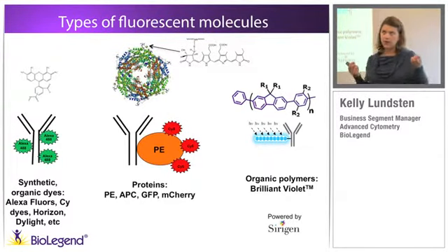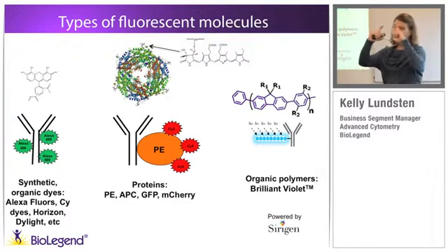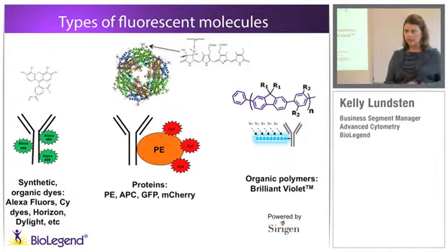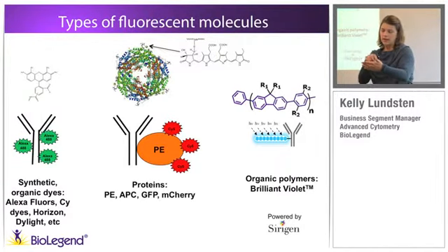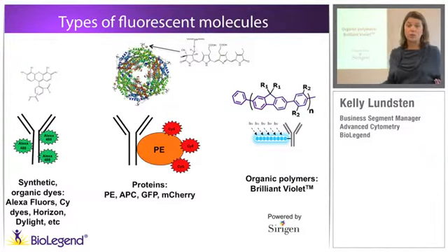And if you think about the structure of what an organic fluor looks like, you have something like a pyrene or any sort of cyclical hydrocarbon. It's a rigid structure, and the element of conductance of this molecule are going to be the shared electron pairs between each double bond of that structure. So the minute that one of those bonds is broken, you can no longer conduct energy around the circuit. It's called delocalized electronic conductance. When you've broken that circuit, it becomes non-fluorescent and basically returns to a state of being a chromogen, which is just a molecule that can absorb energy, like the color of my shirt, but cannot resonate it and emit it back to you.